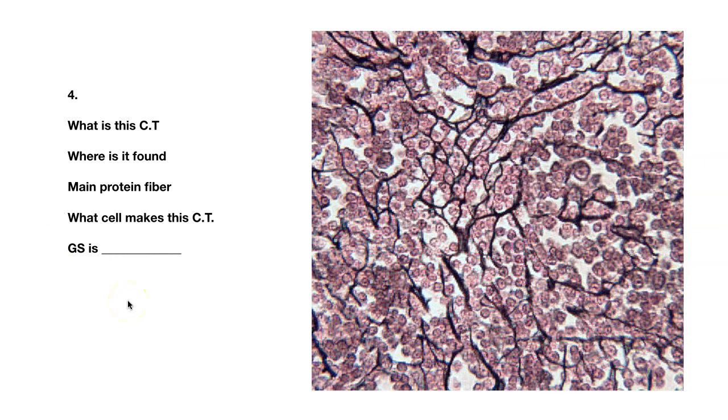Here's slide number 4. What is this connective tissue? Where is it found? What is this main protein fiber right here? You can see these little branches of protein fibers. What is this protein fiber? What type of protein fiber is this?